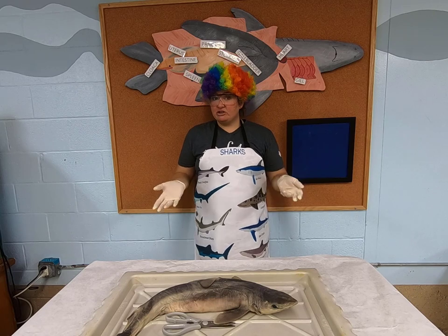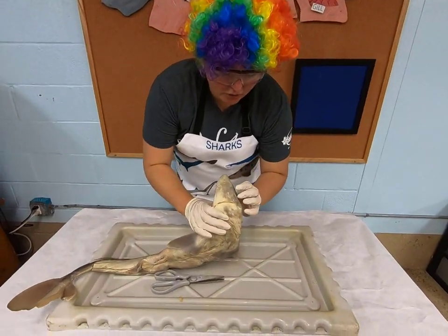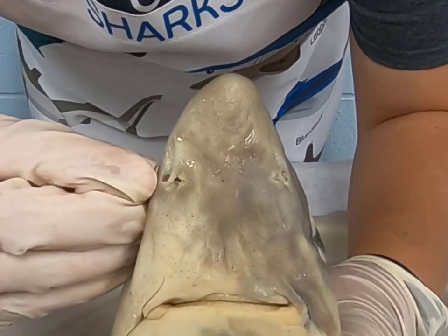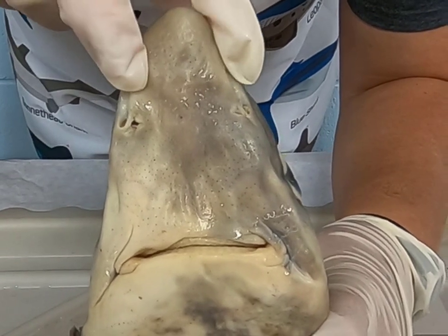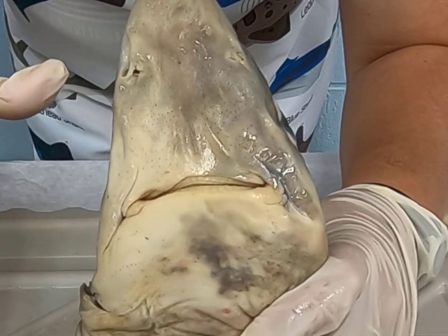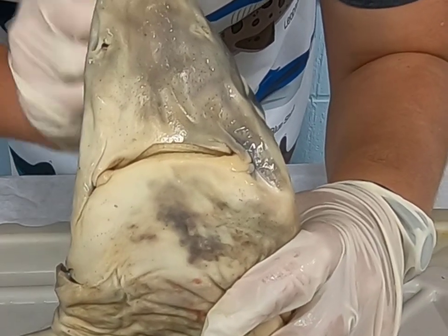So sharks have a really good sense of smell. Now, we don't call them nostrils in sharks, we call them nares. So their nostrils, or nares, are right here underneath their nose. And if you can see, you can count four openings. 1, 2, 3, 4. The top two nostrils are for taking in water. The bottom two nares are for expelling water. That way they can smell through the water both times as it goes in and out.